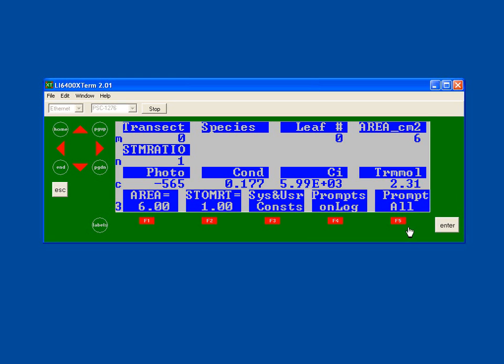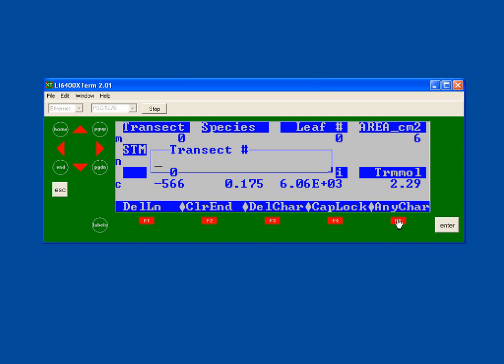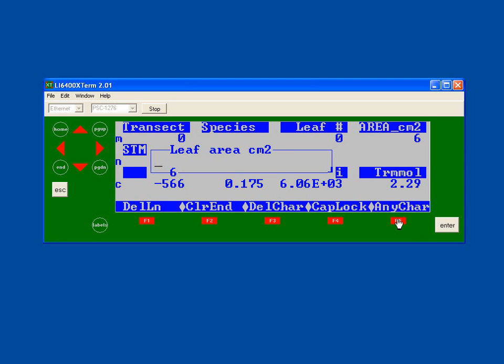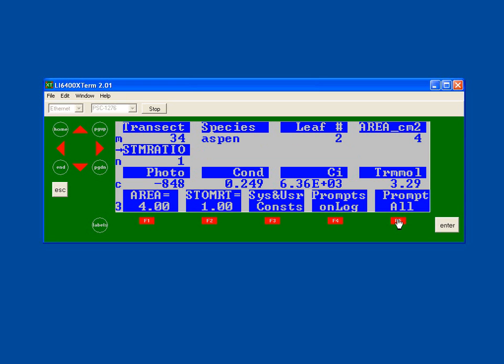If you'd like to just test them, go ahead and do a prompt all, F5, and you'll see your questions begin to appear. And go ahead and enter something. And there you'll see all of the answers appear up on our display. Now, if we would have had a log file open and pressed the log button, you would have gotten exactly the same questions that appeared here.